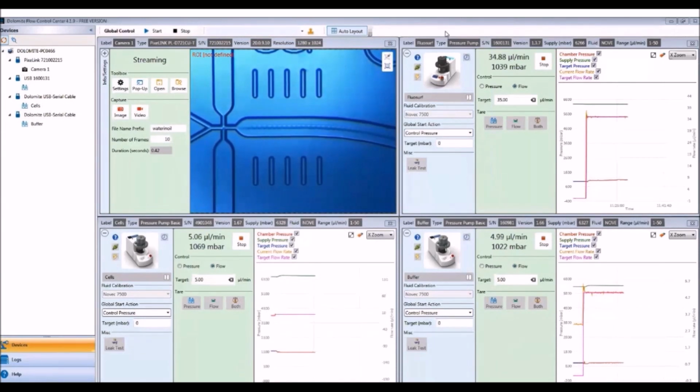And the real-time graphs on the side also show you how stable your flow is over time. So if you do tend to go away from your workstation, you can always come back and check if your flow has been disrupted or not. So that's always nice information to have at hand. We are able to get log files if you so desire to figure those out.